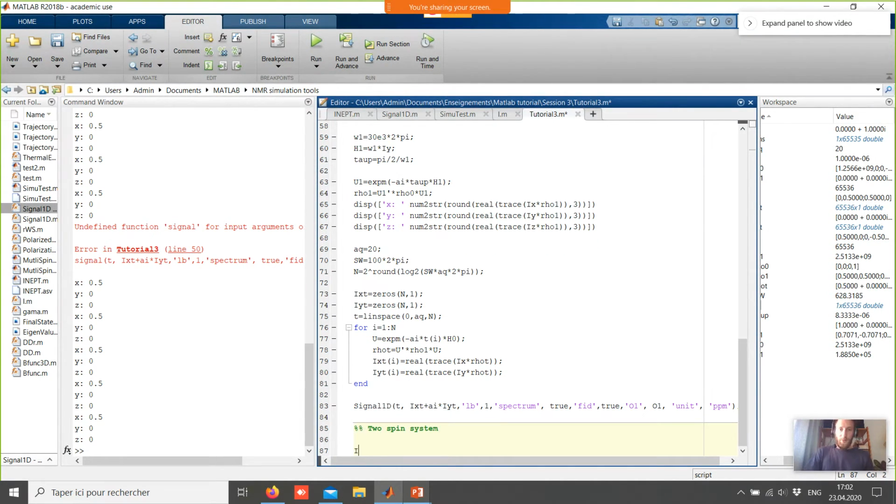If I want to write I1, now I will call them I and S because I find it more convenient. So IZ, IZ will become the Kronecker product, and for this we simply write kron. No, let's define it differently like this, otherwise I will have problems.